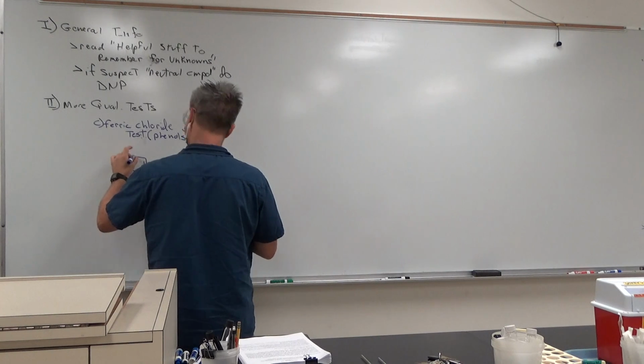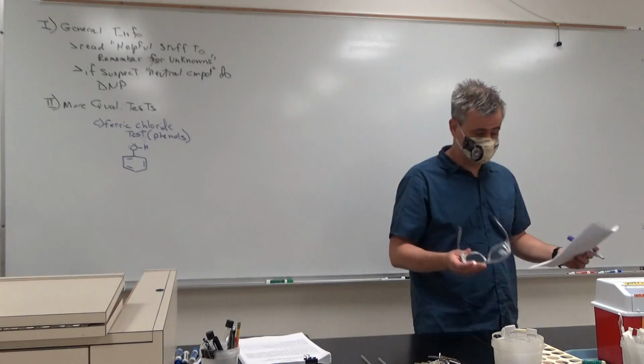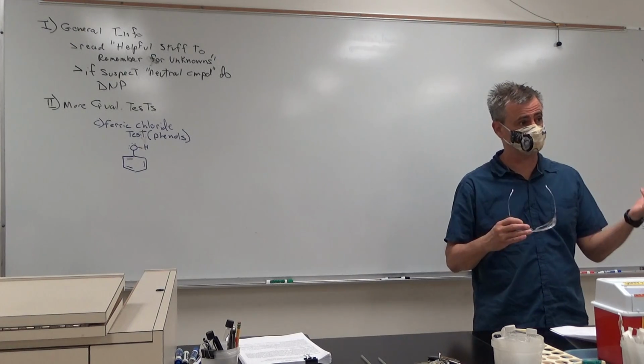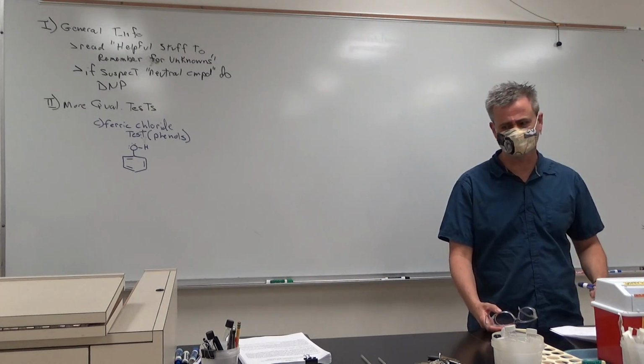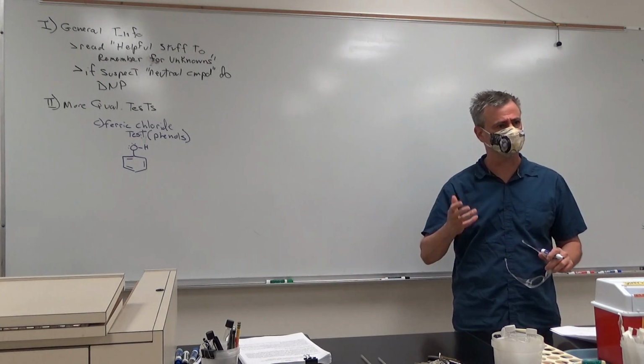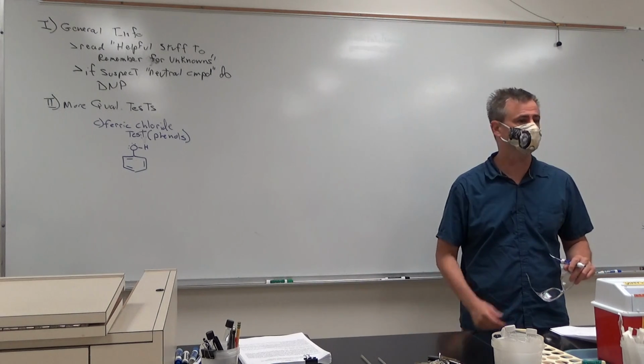Some of these tests, by the way, have a couple different solvents to do the test in. And that's because different unknowns might not be soluble in different solvents. I can't remember, I think for this particular one, there's 2 different solvents that are suggested. You can do either one, actually.